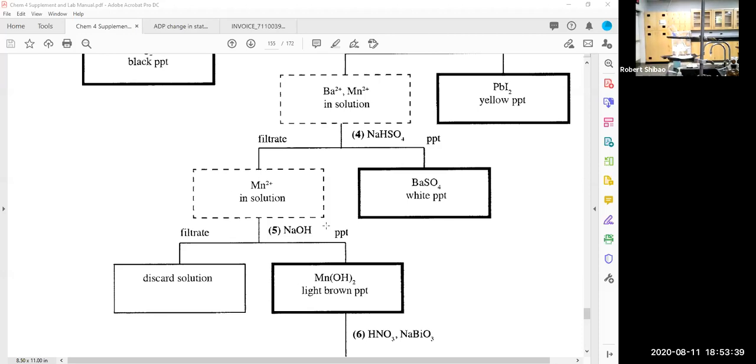Sometimes you have to do this yourself in lab. So there'll be large bottles of stock solution. And again, when you pour, you want to grab it by the label, or you want to look at what side the drippings are on, and always pour it so that the drippings end up on the same side. That way there's less risk of contact.